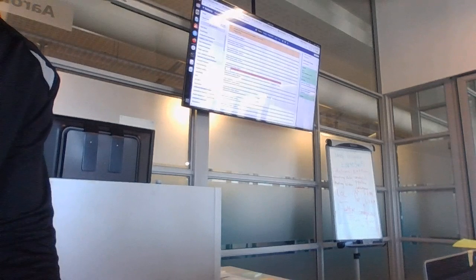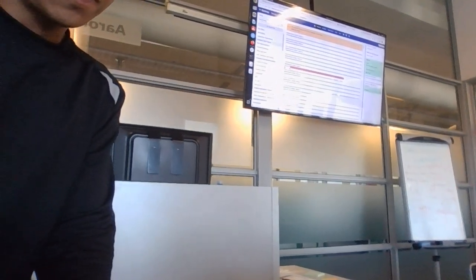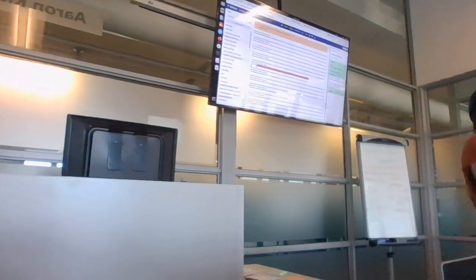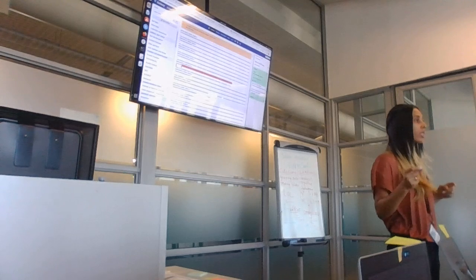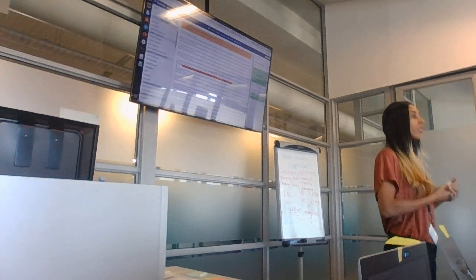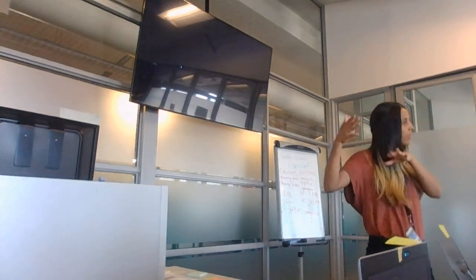So you are comparing 90% human reads to this. It doesn't matter if there's a section the reads don't cover, because there are more differences between a human reference file and a Vibrio cholerae reference file. So much so that small missing spaces won't make it a completely different species. It will still be human, there'll just be gaps in different places.